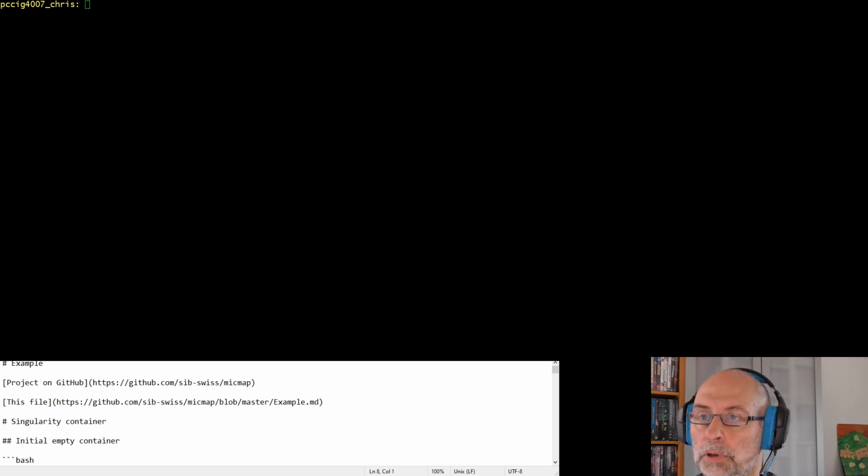All these tools are command line tools, so you can do it in your terminal. And so to get started, I will show you how it is on GitHub, that the tool should be retrieved from GitHub.